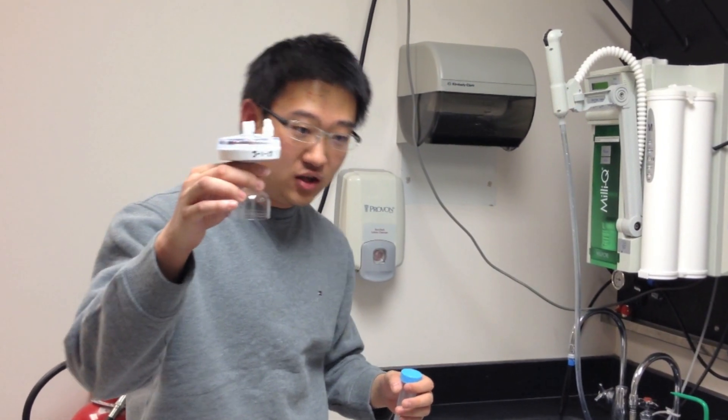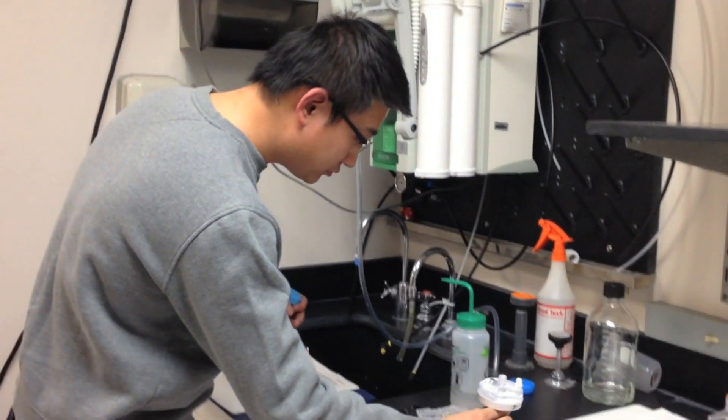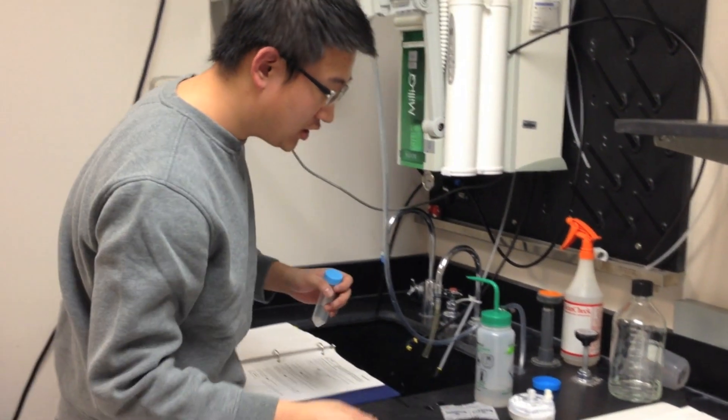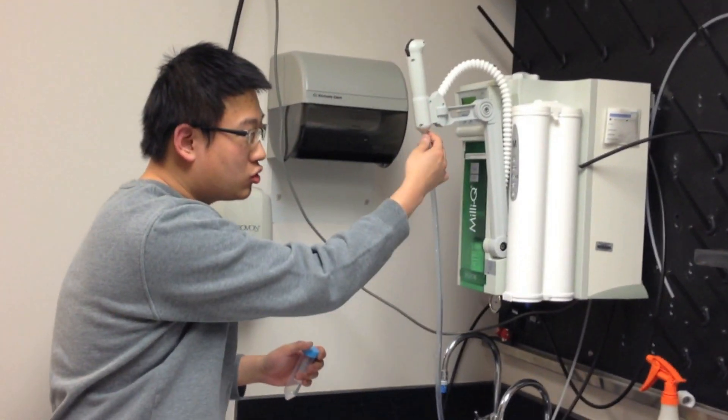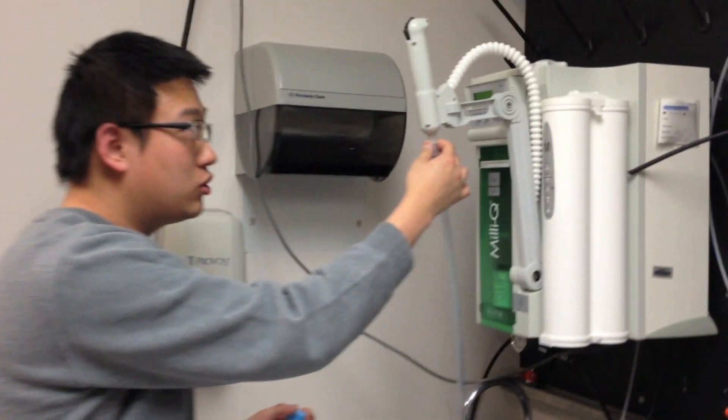Later on, we'll put this in the cold room to minimize the evaporation. Then secondly, you screw this Teflon tube to the water dispenser.